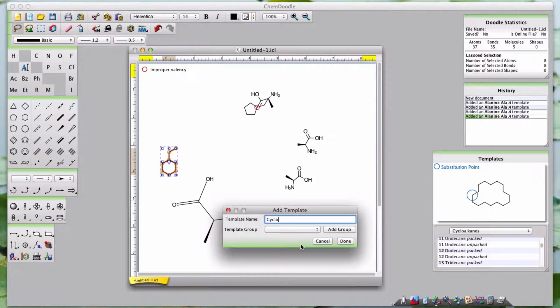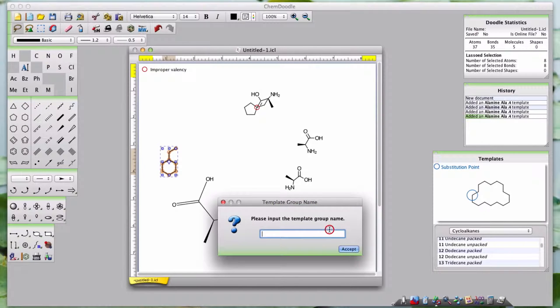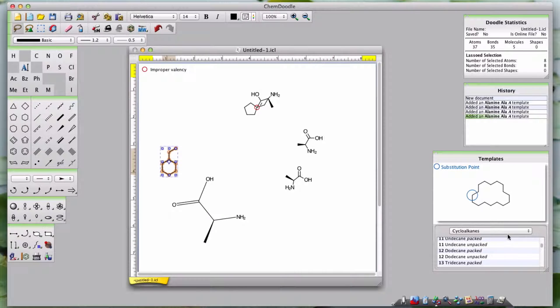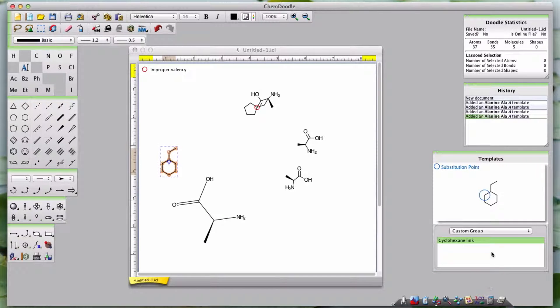You will also have to create a new group for any templates you wish to create, as they cannot be added to default template groups. Click Done when you are finished. You will then be able to find your new template in your newly created template group in the drop-down tool.